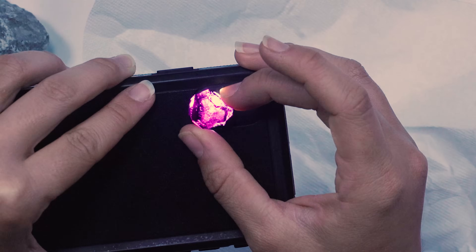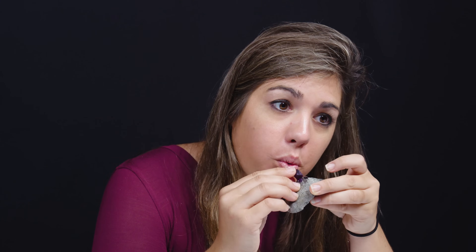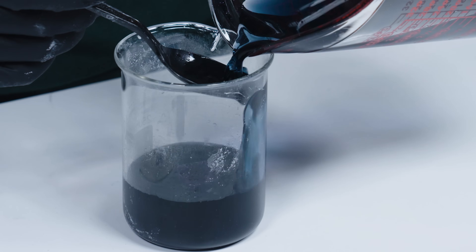A lot of times on videos on the internet, people don't show you the mistakes or the trial and error. Don't do that. From what I've seen so far doing crystal experiments, it doesn't go the way that you plan. I just heard a crack. I'm actually kind of hashing out the problems that I run into so that you guys really don't have to.